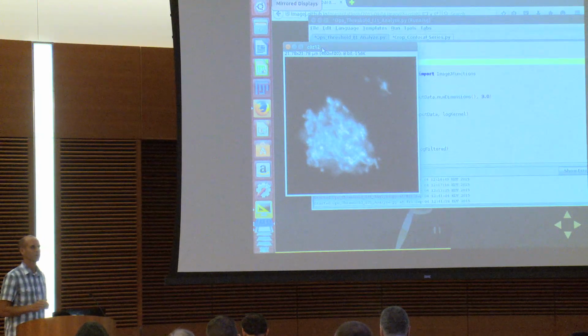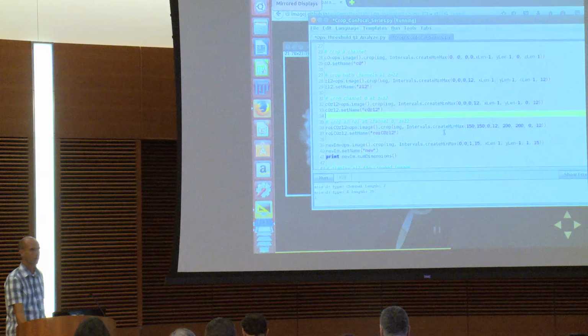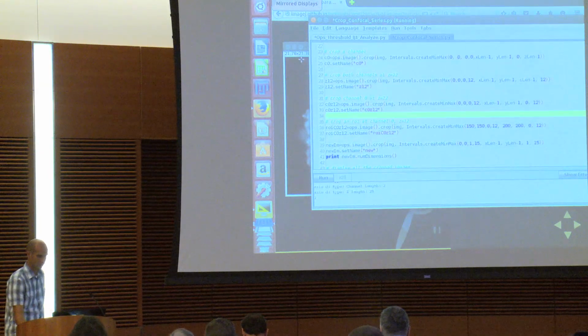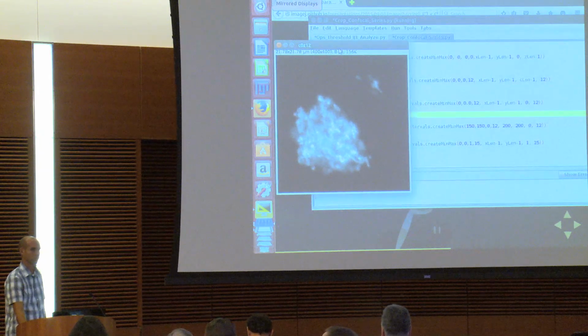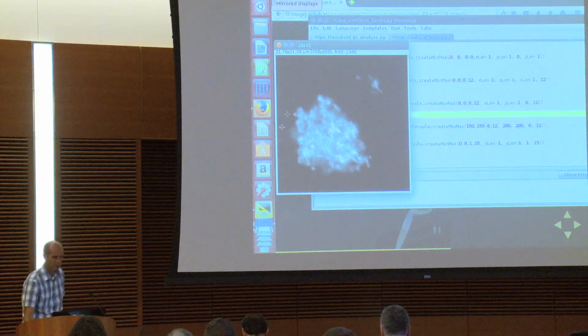If you're going through these tutorials and just getting an explosion of images, just close everything, open up the confocal series sample image, and run the crop confocal again, and you'll get the cropped images that we need for the next step. Does anybody want more time to quickly do that?